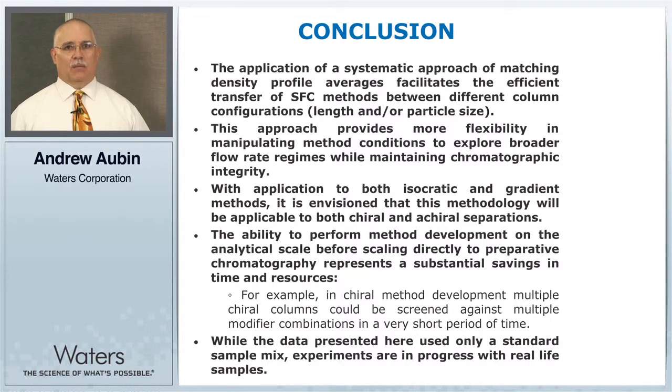The data here was shown only using standards. The next steps in this process are to use real-world samples and real-world workflows.